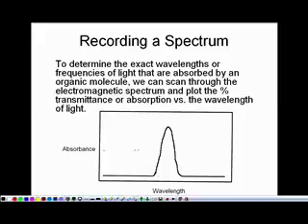If you took analytical, or if you're taking analytical, it'll end up the same way. You use the quantitative aspect of this. We're going to look at the position of the absorbance peak to tell us something about the structure. All the spectroscopy techniques will involve some sort of scanning through the light and measuring the corresponding absorbance and looking at a spectrum. So the peak and the peak position is what we're looking at.